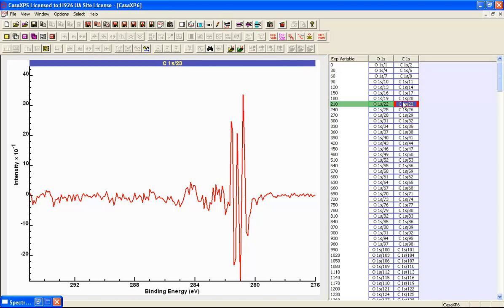And if we do this, we should maintain the information in the spectra. We should see all the shapes within the spectra, but what we should then lose is all the noise that is now accumulated into these lower abstract factors and the partially calculated vectors.